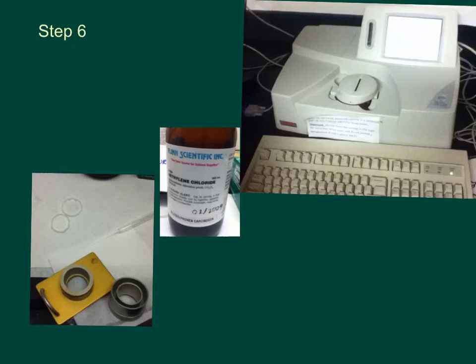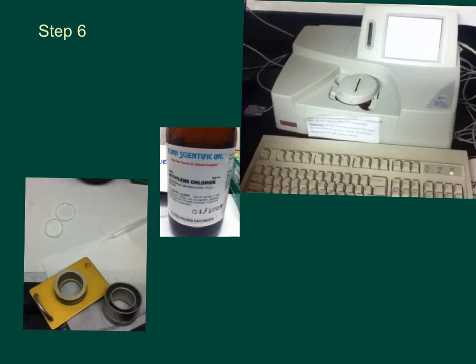So finally, we're going to be testing our product to see if we have what we think we have, and we're going to be running it in this computer here that collects the spectrum. What we do is we use methylene chloride to clean these little cells. We're going to be putting our sample between here like a sandwich and then placing it into this little apparatus, closing it in, putting it into the computer, and taking down the IR.